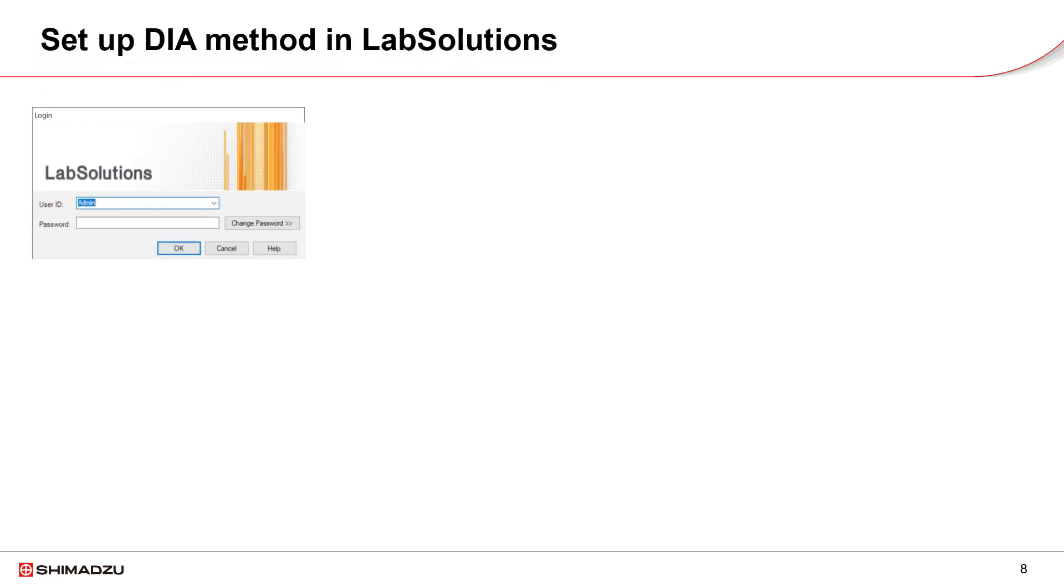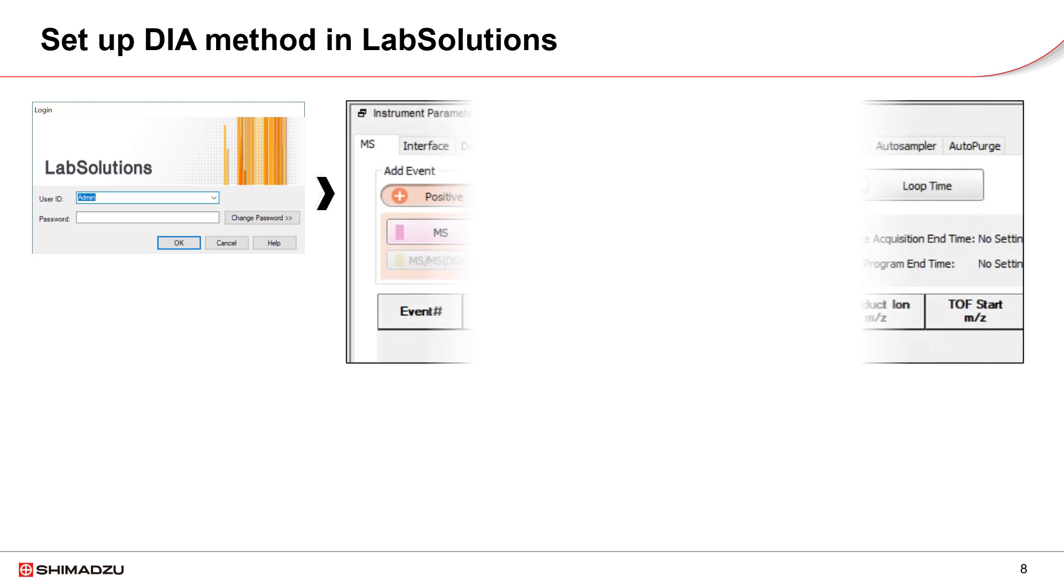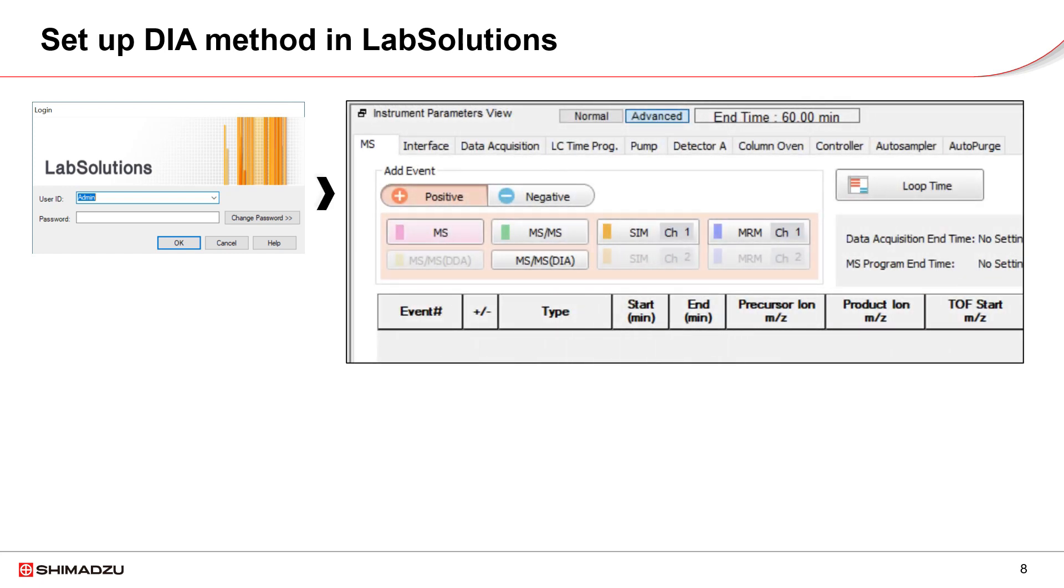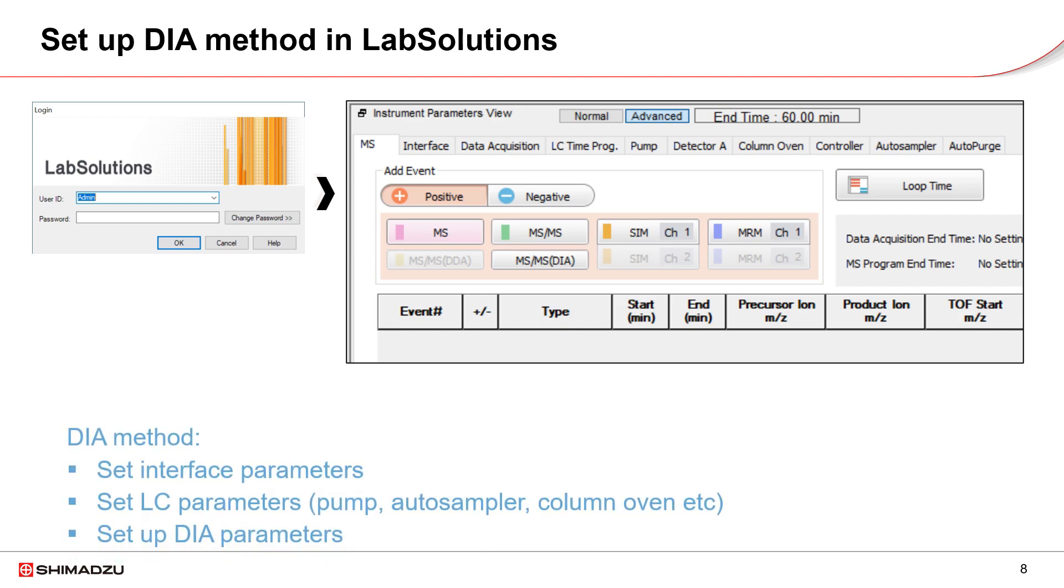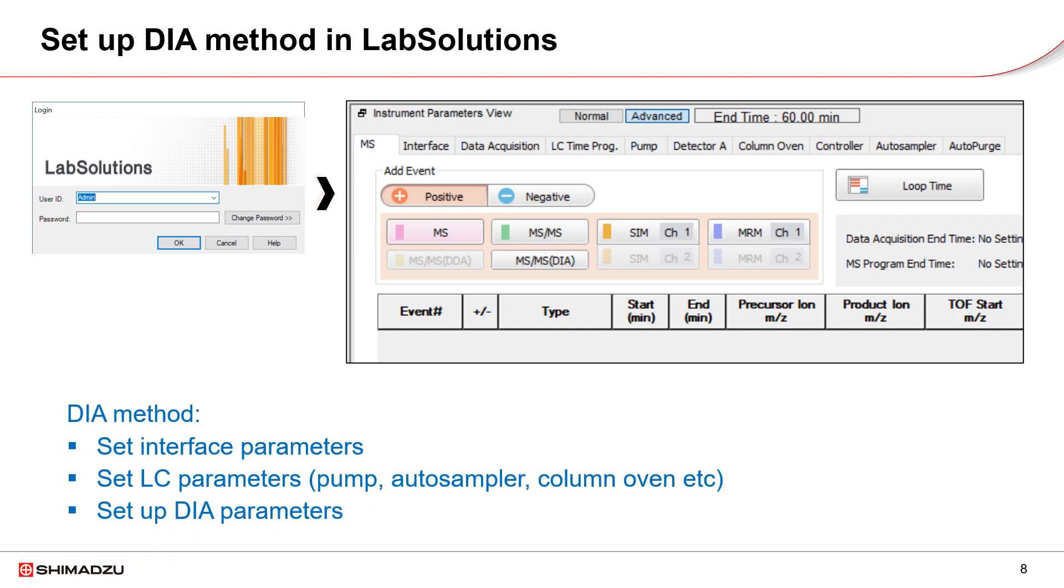Now, let's set up DIA method on the LC-MS-9050. Start the LabSolutions workstation. We first set up the interface parameters and all LC parameters. Then, focus on the DIA method setting up.